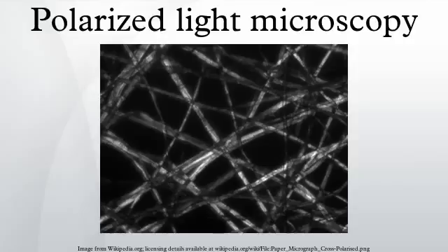As the order of the optical path difference increases, then it is more likely that more wavelengths of light will be removed from the spectrum. This results in the appearance of the color being washed out, and it becomes more difficult to determine the properties of a sample. This, however, only occurs when the sample is relatively thick when compared to the wavelength of light.